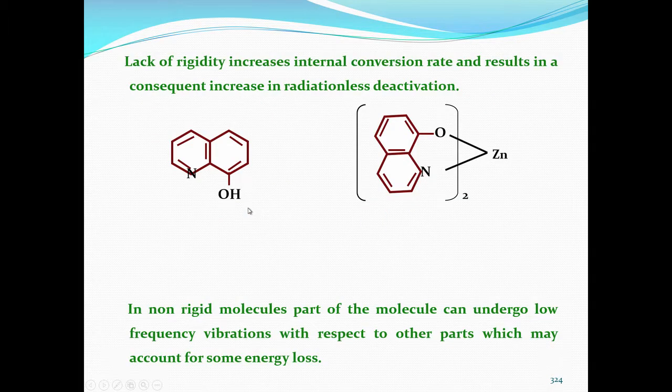Lack of rigidity is another problem. Lack of rigidity increases the internal conversion rate, and that results in a consequent increase in radiationless deactivation, that is, solvent-solvent interaction, molecule-solvent interaction, and molecule-molecule interaction. There are 3 types of interactions where collisions will take place and the fluorescence decreases.